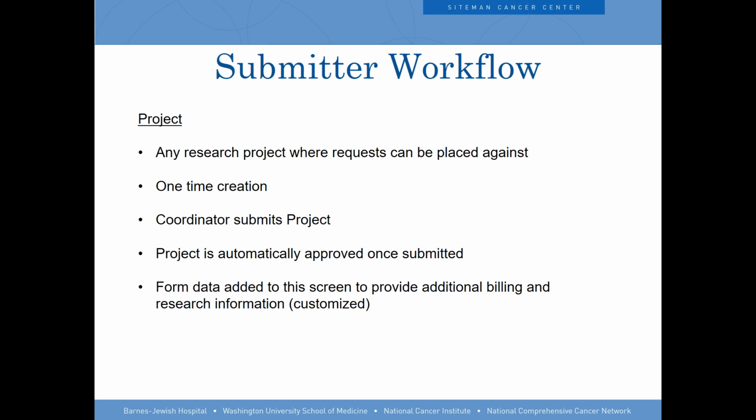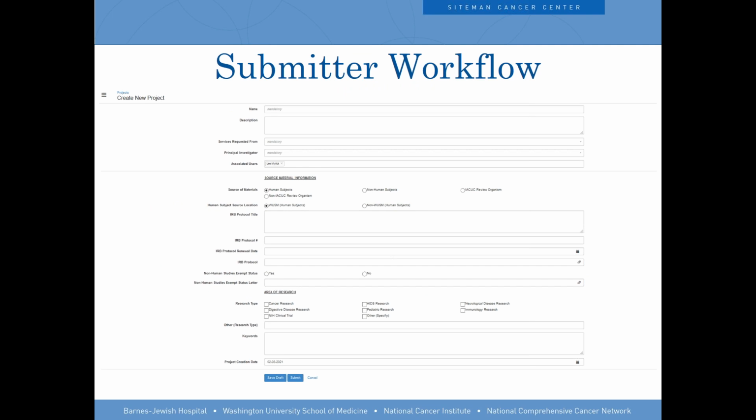And then, we have these customized forms that we created that collect a whole bunch of other information that the tissue procurement core was dying to get their hands around, and was recording offline in Excel for a while. And the cancer center itself needed information about which studies were actually cancer, so that we could apply subsidies to billing and things like that. So that gets all tied into this process.